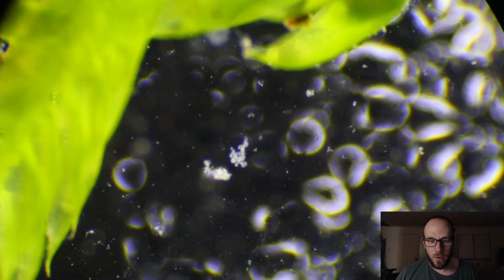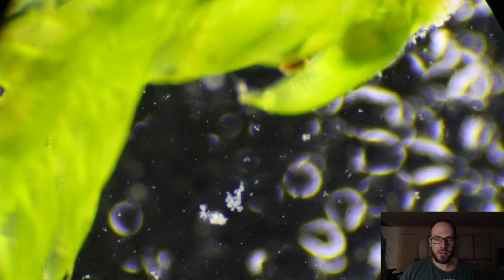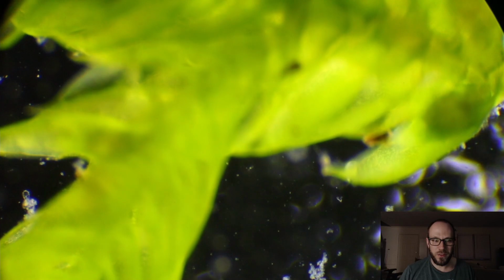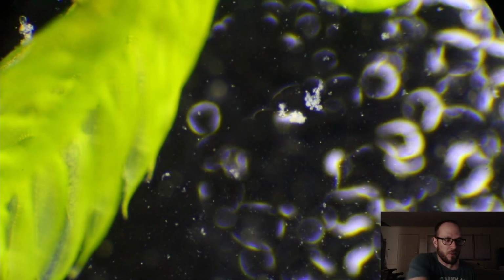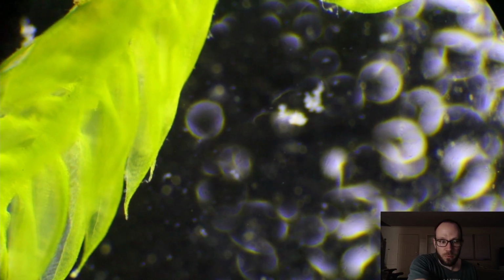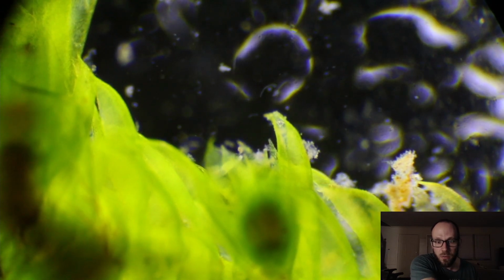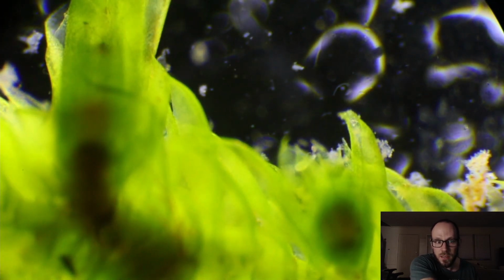But here we are. I decided to do this on a whim, so that's why I'm doing it now. There will be more of this during the Extra Life stream. So this is my favorite slide. We've got stuff swimming around everywhere. It is replete with life. Let's find some good... Oh, rotifers everywhere. You just see them wiggling their stupid rotifer butts.